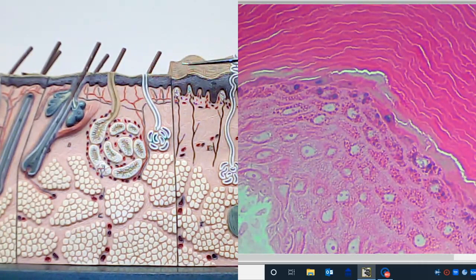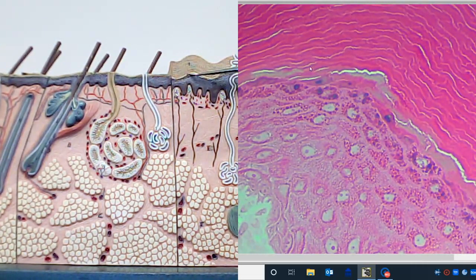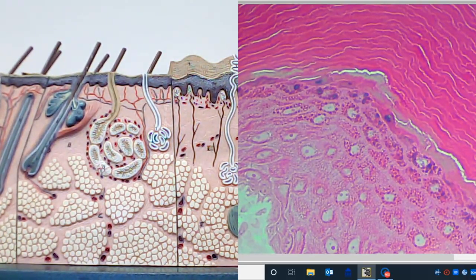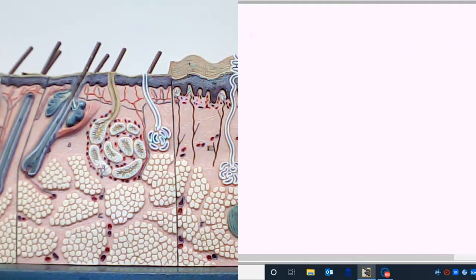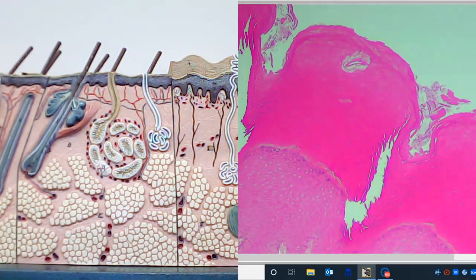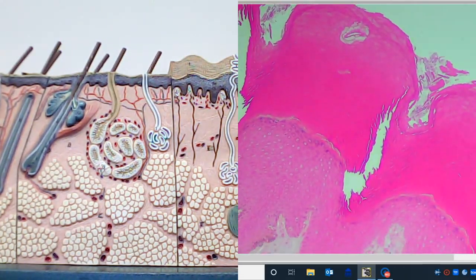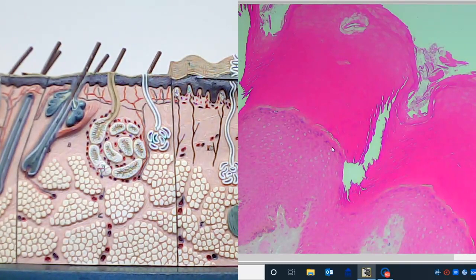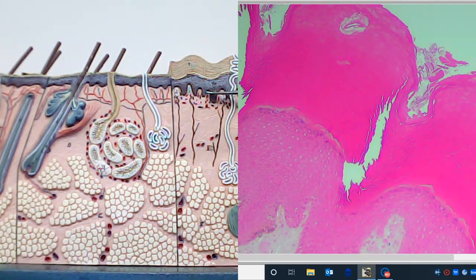We can see the stratum corneum and the stratum lucidum, which is the thin layer between the stratum corneum and stratum granulosum. The stratum corneum are cells that no longer have a nucleus — they are dead cells that have been filled with keratin to help protect those deeper structures. Moving back to the 10x objective, we can see all five layers: stratum corneum, stratum lucidum, stratum granulosum, stratum spinosum, and the very basal layer, stratum basale.